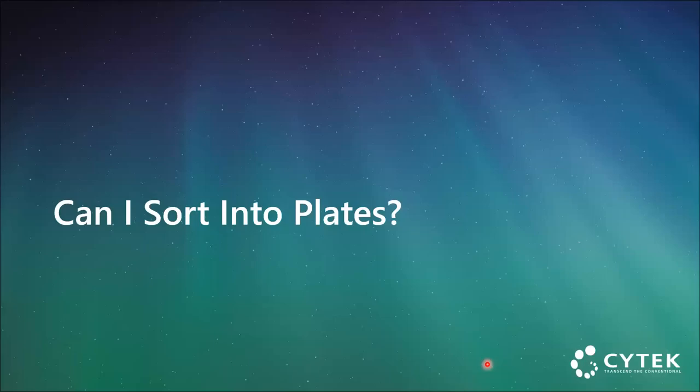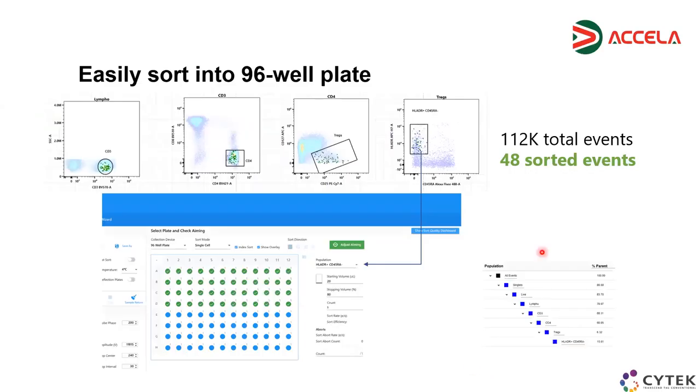Can we sort into plates? The answer is yes. Here you can see also the software sort control, which is integrated into Spectral Flow, the general acquisition analysis software that can allow you to sort in plates. And also here, basically you decide which is the population of sorting, the starting volume, stopping volume.